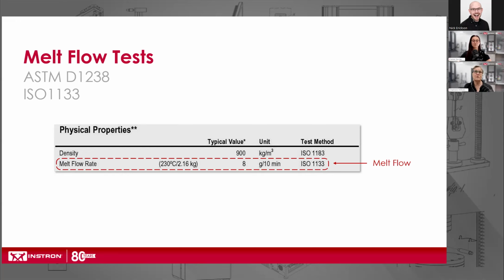You can look at the spec sheet, see what data the supplier is saying you should get, and run the test and do a quick QC check on it. As well, it can be used to compare new materials to determine quickly which is a better material to use. And it can give a snapshot to determine if the polymer is suitable for a specific molding application or not.